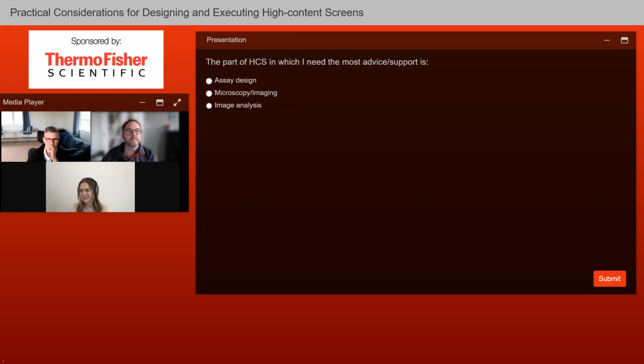This next question asks, which part of HCS in which I need the most advice or support is assay design, microscopy or imaging, or image analysis?